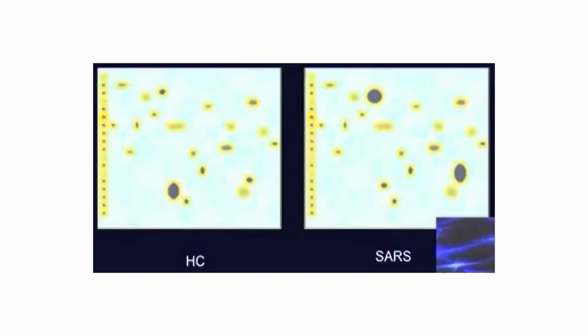So this is how the proteome analysis was observed. You can clearly see that in healthy control, this is one specific protein which is highly expressed, but in the diseased one it is low, it is not that expressed. Similarly, this specific protein is overexpressed in the diseased patient. Similarly, this specific protein is overexpressed here. So in terms of this image, you can do visual analysis as well. But the software will give you exactly how much it is higher than this and how much it is higher than this. Accordingly, we can know by software analysis.